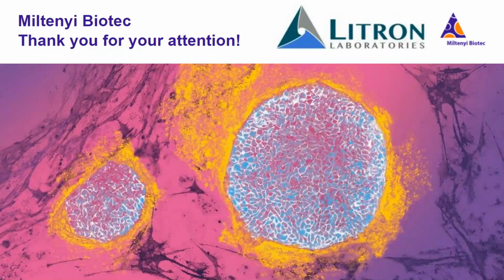Most researchers are comfortable running controls to make that evaluation, but there's still some subjectivity to where those gates are placed. There's also a convenience in having it done automatically. So Miltenyi has a technology called an express mode, which I briefly mentioned, but basically it's a custom algorithm trained on data from your actual assay. So it can incorporate donor to donor variability, or really whatever the flex is in your assay itself.